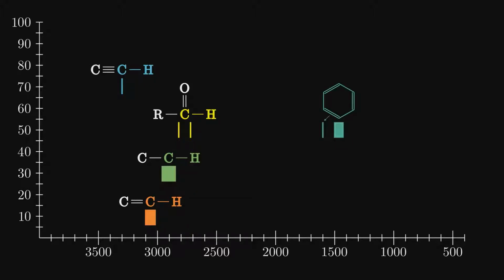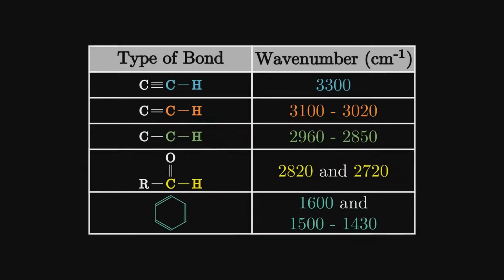Though we've seen it already, I should put the benzene ring on the screen again. After all, the ring is composed of sp2 carbons, so it is worth checking if there was a peak in the range for hydrogen and sp2 carbons. Though the spectrum reference is helpful, I do like having this information in chart form. We have more to come, so I split this video's reference into two.